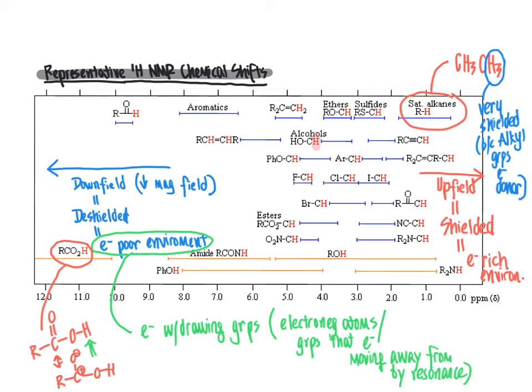So don't be tricked or mistaken into thinking that you would expect this particular hydrogen that I'm putting the laser pointer under in the alcohol to be the one that's showing up in that 3 to 4 region with the blue bar. Instead, it is just this one that's shown in red here. The OH group has its own chemical shift because that is going to be a more generally downfielded, deshielded hydrogen atom there because it's directly bonded to an oxygen atom.